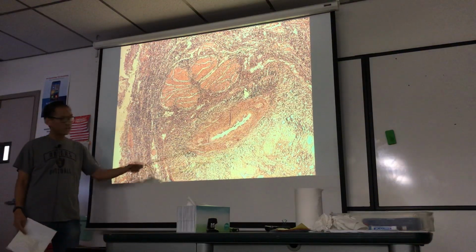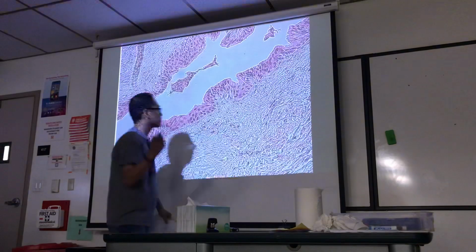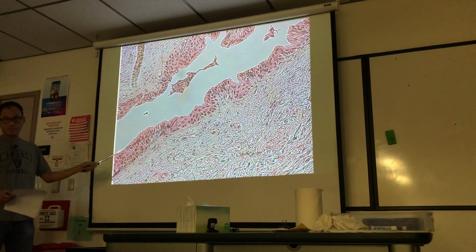It's a transitional ET. If we advance the slide, I feel like I have a close-up of that. Right here. Transitional epithelium of the spongy urethra. Okay?